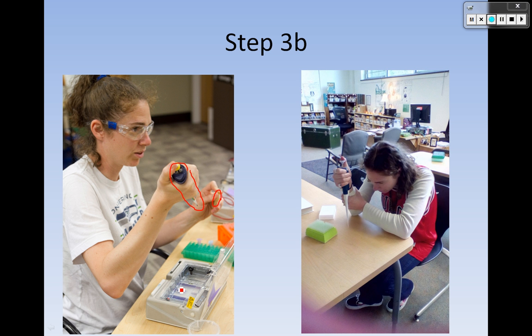And then I'm going to put it, I have a gel in here that you probably can't see, into the little well. So it's just like using a pipette, except it's a really small, very precise pipette. This is me demonstrating without an actual gel box in front of me because I was doing this at school. I guess this was actually today. But I wanted to show you the procedure for putting it into the wells.